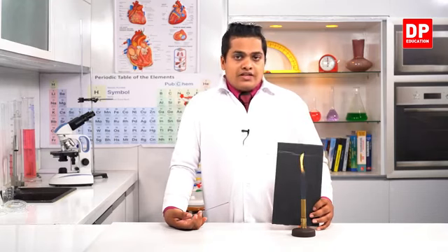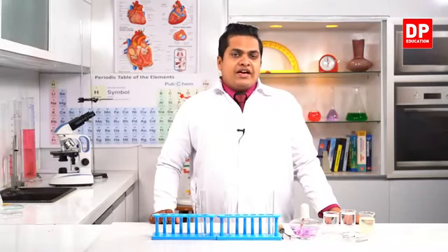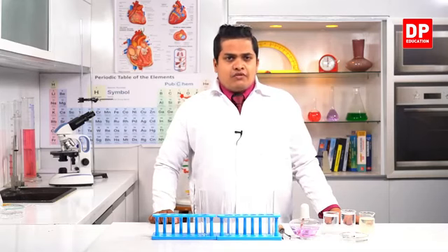So we'll head on to the classroom and we'll observe what kind of things are contained in each of these zones. Right, my dear children? Now in this activity, we'll be identifying the factors which are essential for the rusting of iron. Especially, we'll be observing whether air is necessary for the rusting of iron, right?